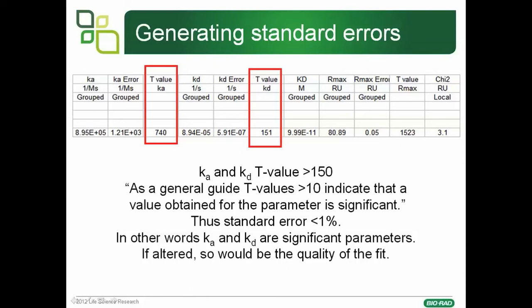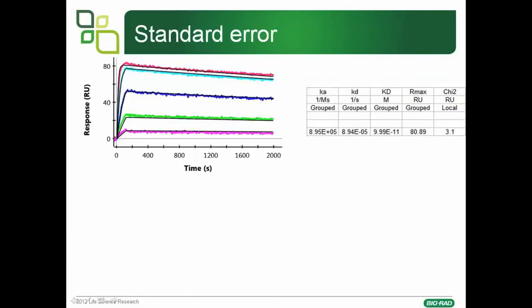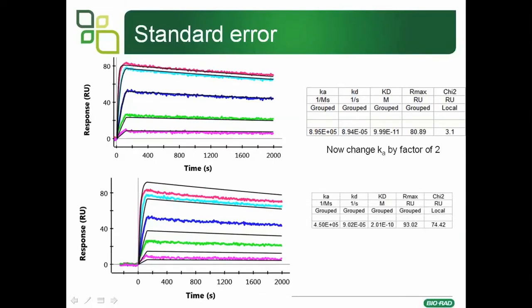To give an example of what parameter significance means: in our ongoing example, to illustrate that this parameter is significant, we change Ka by a factor of 2 — Ka is now halved. You can see visually that the data no longer fits, i.e., the fit lines do not go through the middle of the experimental data. The chi-squared has jumped to 74, which is almost the same as Rmax and no longer meets our criteria of being only a few percent of Rmax.